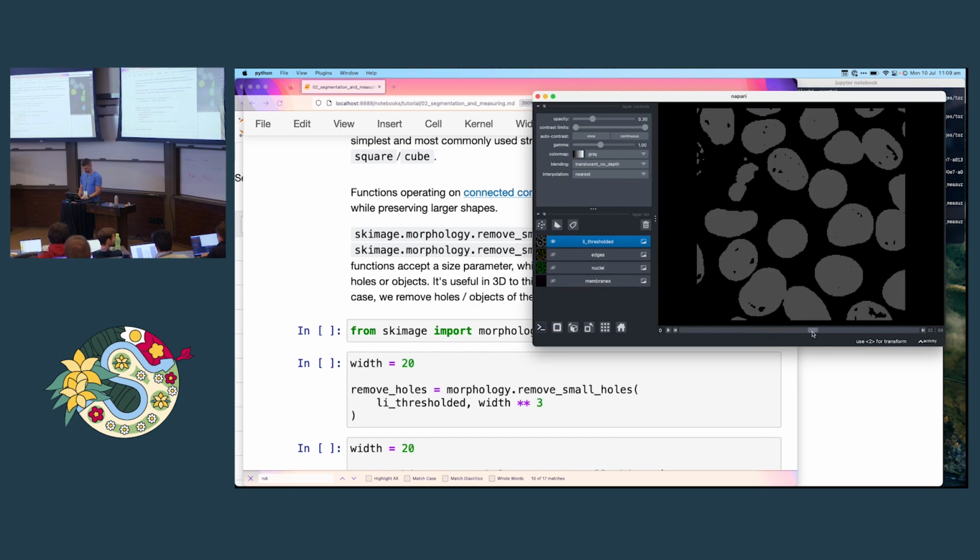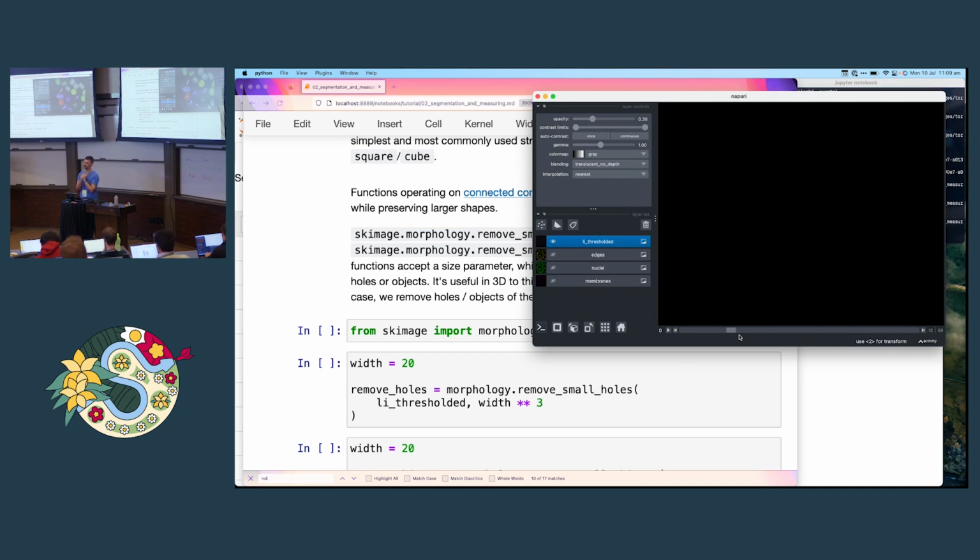So if I do this and show them in napari, and I need to change something here, which is loosen their depth. Sorry, I thought I'd changed that. So the points are inside of these shells that we're showing the labels as.